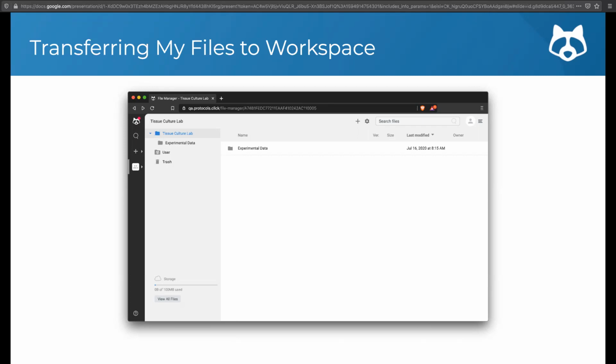But if you are planning to publish your research and you don't need more than 5 protocols in your workspace, 5 private protocols, and you plan on publishing, then you can continue to publish protocols as you see fit.